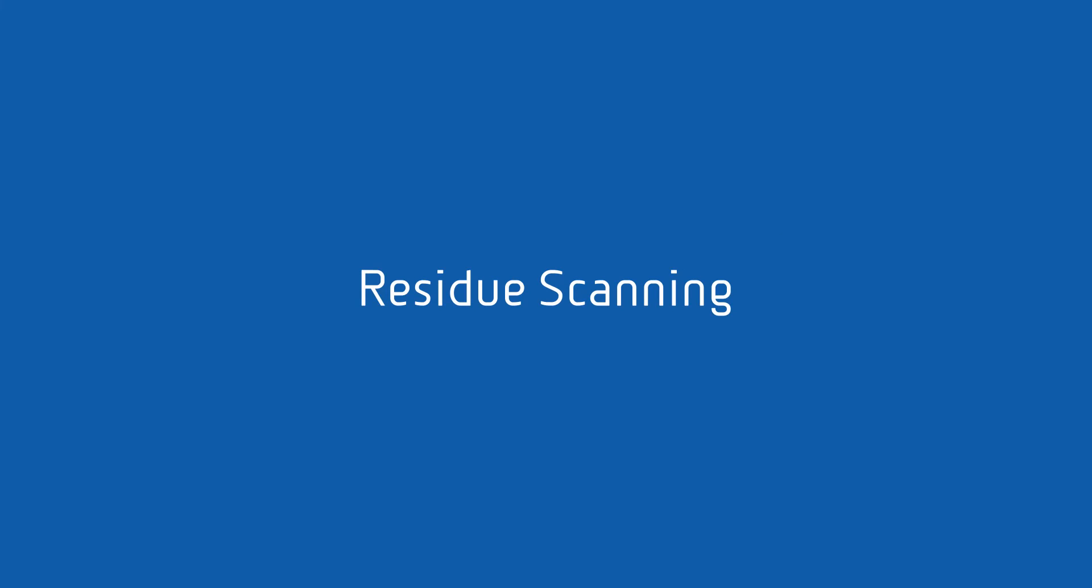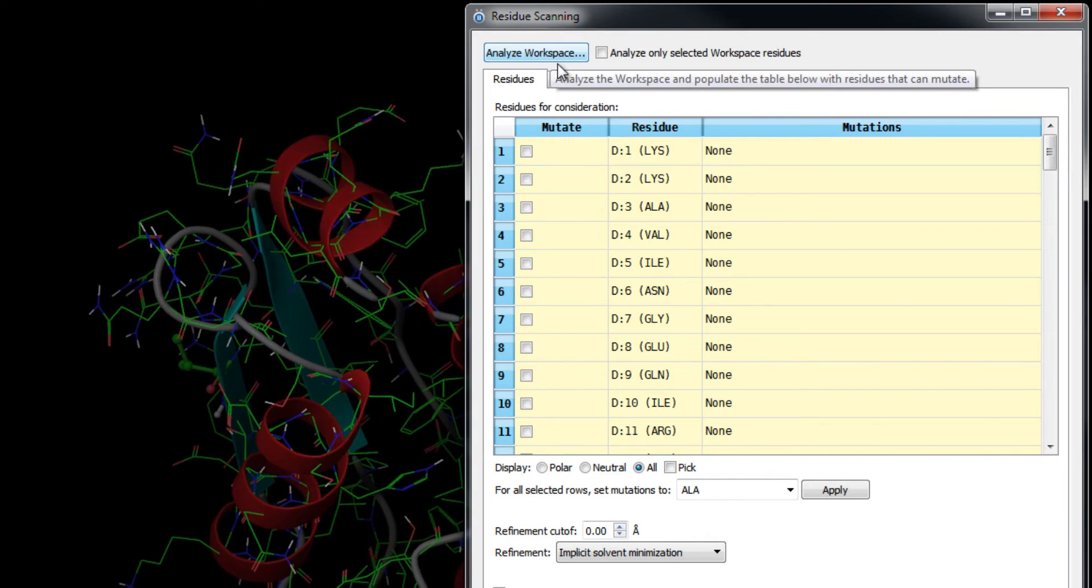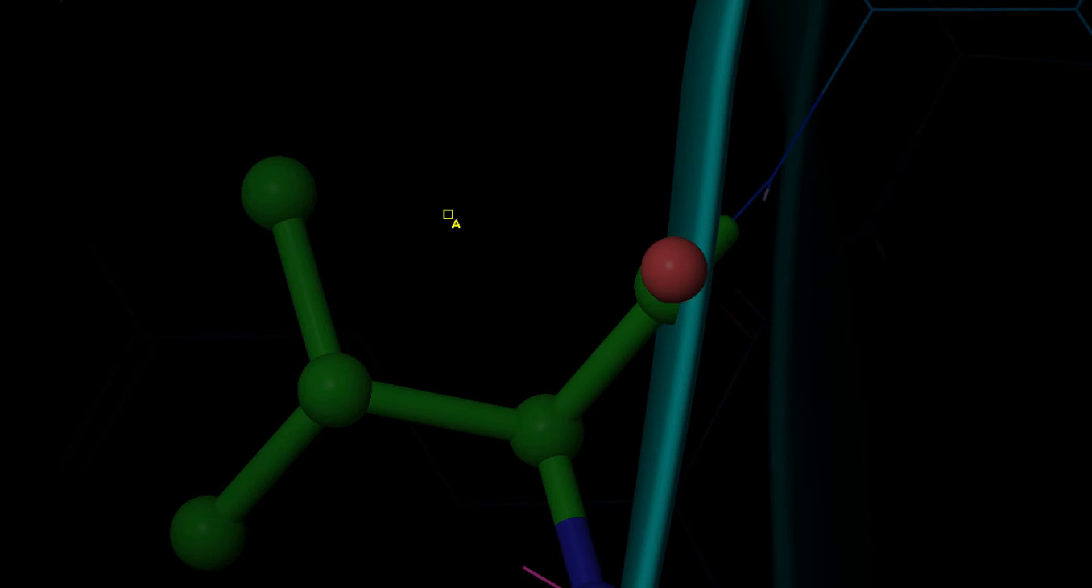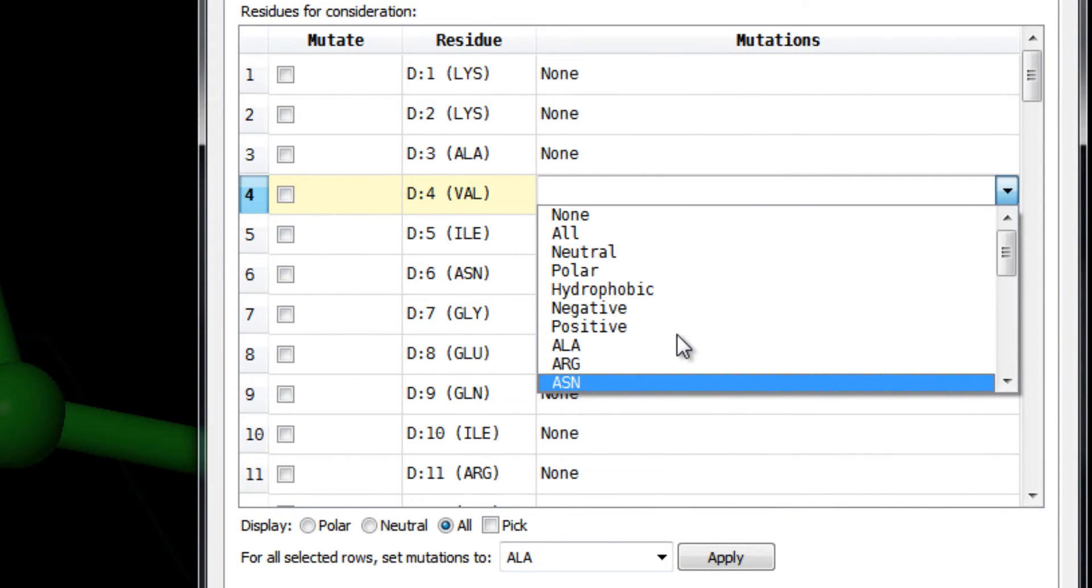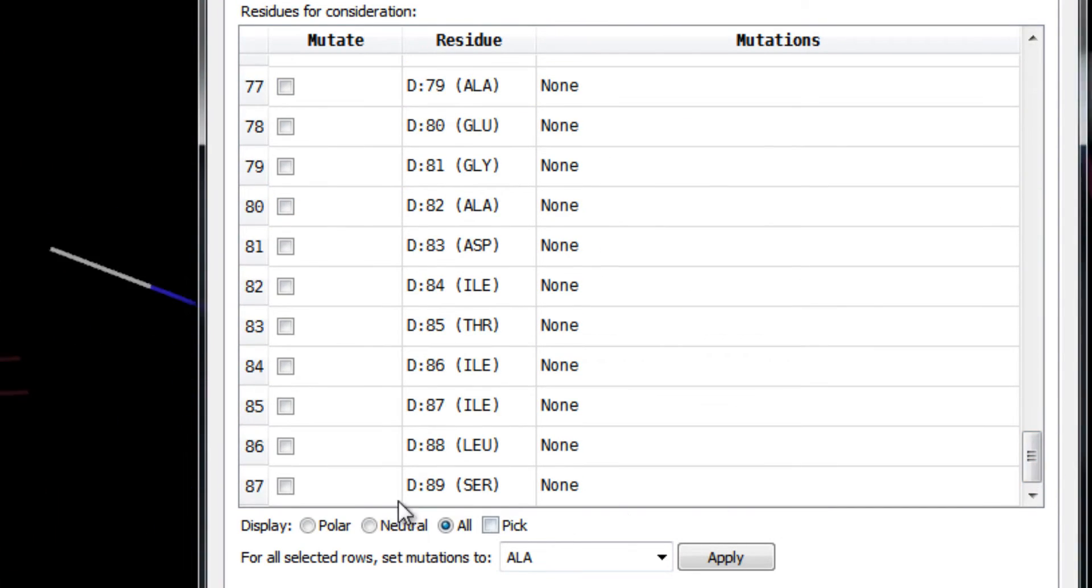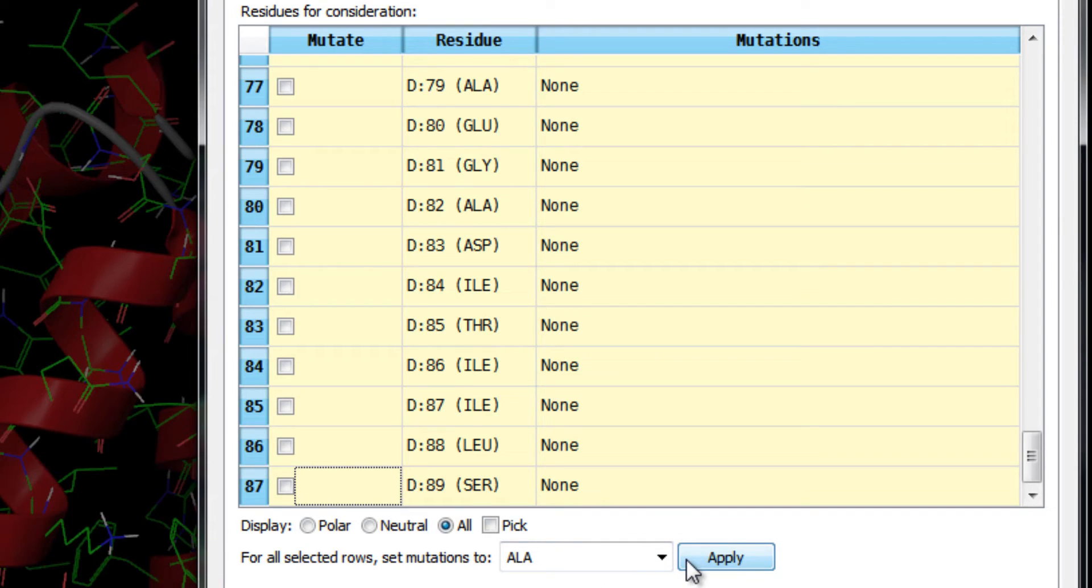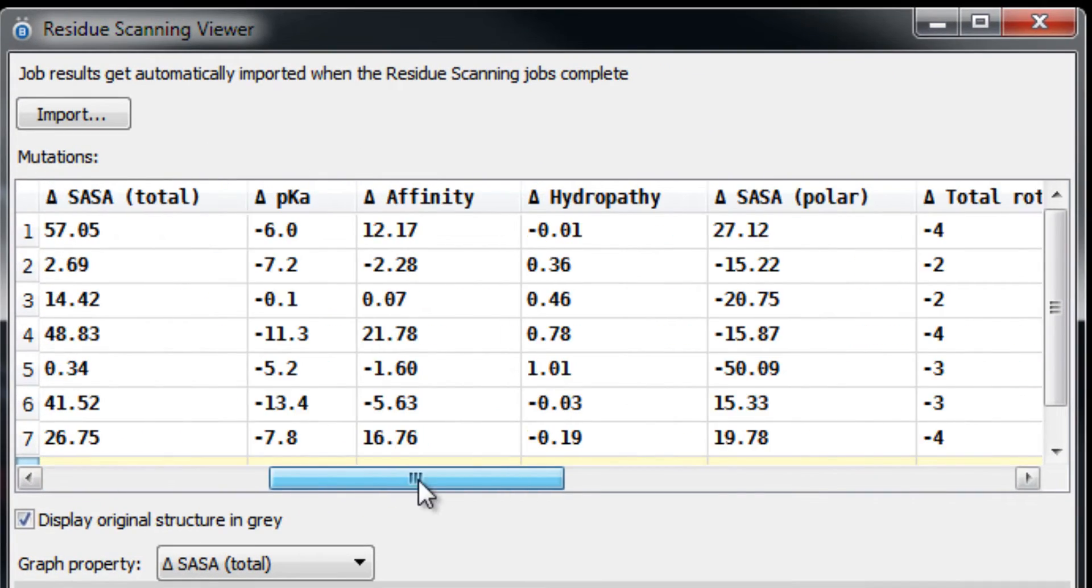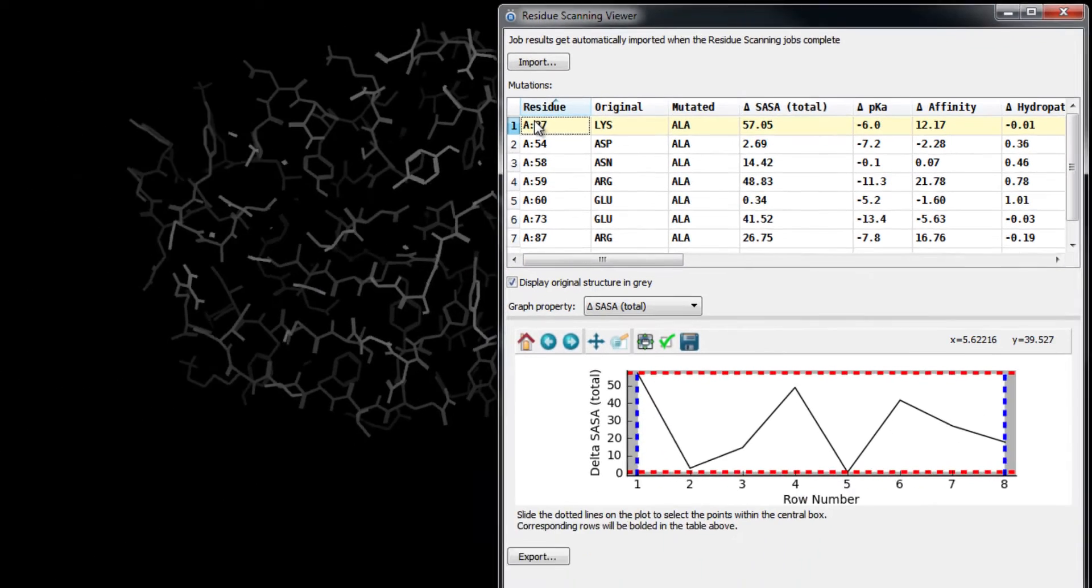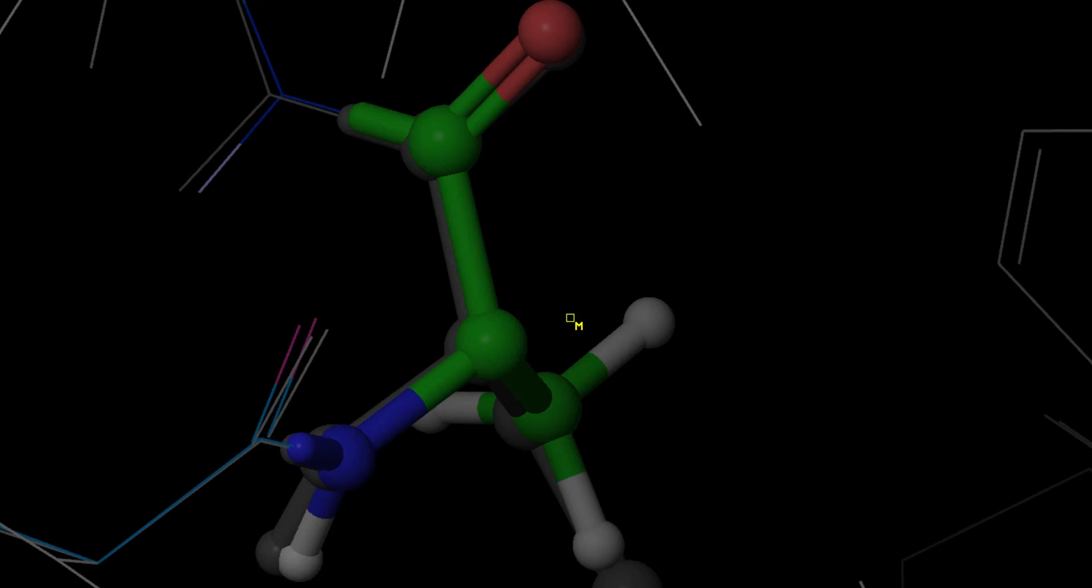Scan a protein for potential residue mutations and generate mutated structures. Select individual mutation sites, then select residue mutations or residue mutation groups such as hydrophobic. Or select the entire protein and perform alanine scanning in just one click. Then analyze and graph mutation results for a collection of properties, including change in binding affinity, to see that some mutations improve affinity between chains while others destabilize the complex.